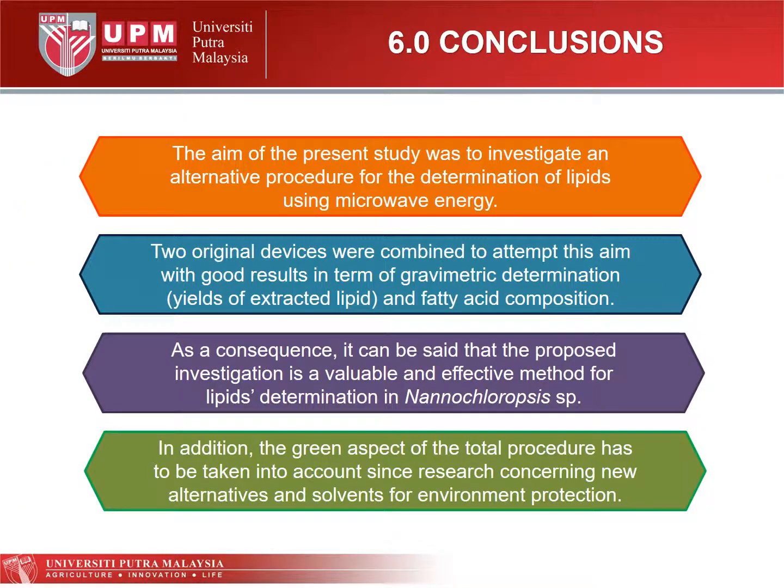Conclusion. The aim of the present study was to investigate an alternative procedure for the determination of lipids using microwave energy. Two original devices were combined to attempt this aim with good results in terms of gravimetric determination and fatty acid composition.